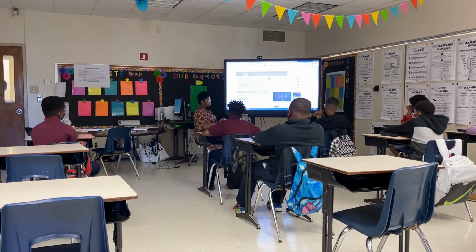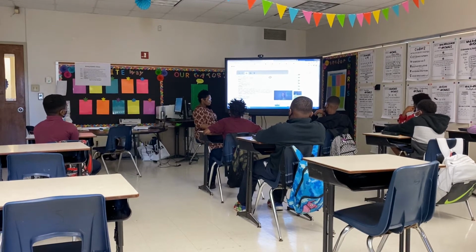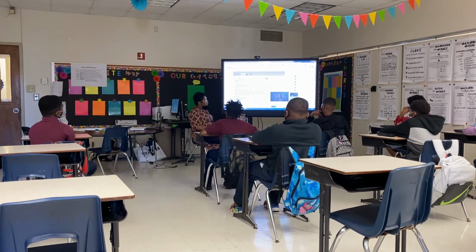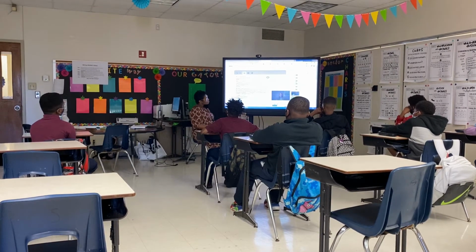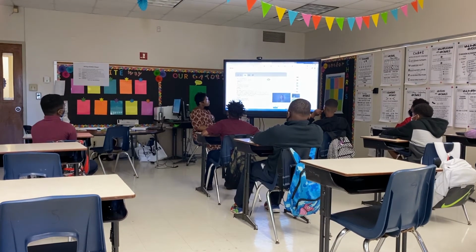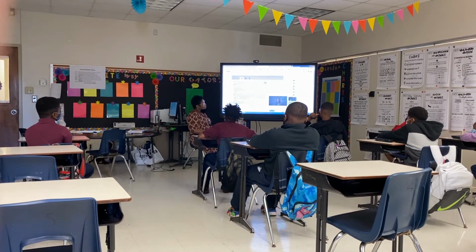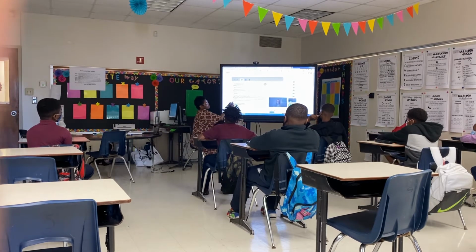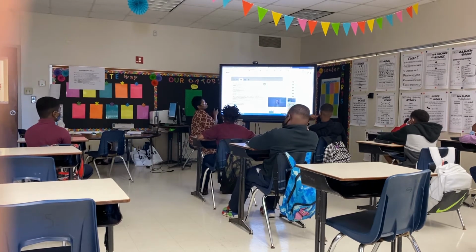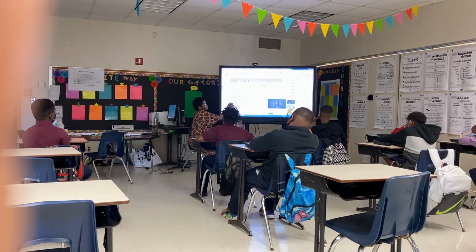It says, Dear food scientists, customers are concerned about food products that contain red dye number 75. Some people believe that red dye number 75 causes health problems in children. Good Food Production, Inc. wants to make sure our customers are safe. We need to test the food coloring that's used in many of our products to see if it might contain red food dye, so we know if we need to submit it for further testing. Please determine whether our food coloring is a pure substance or whether it is a mixture. If it is a mixture, please determine whether red dye is part of the mixture.